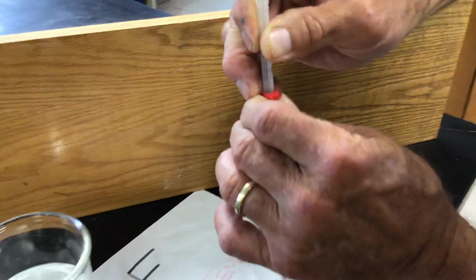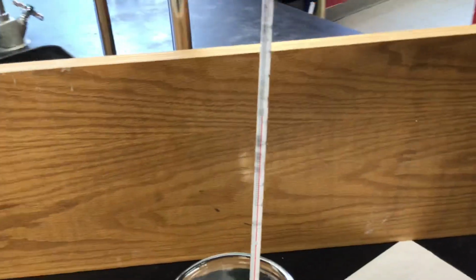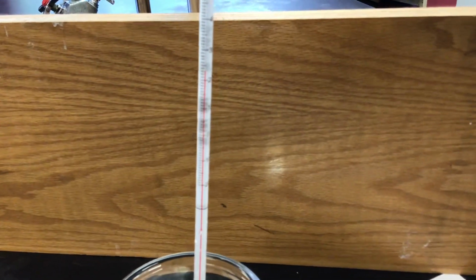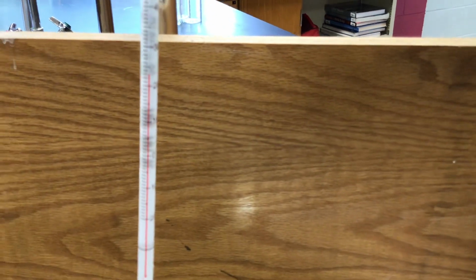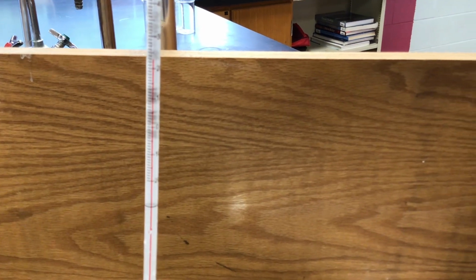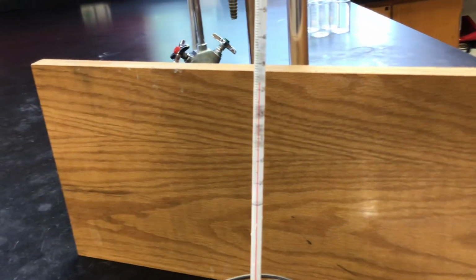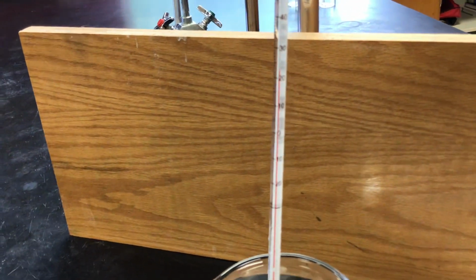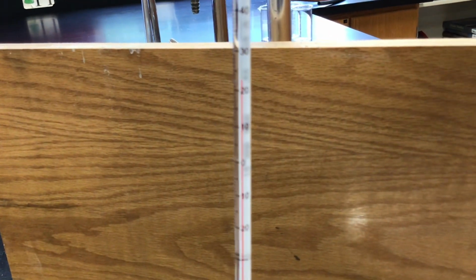No, this is not a mercury thermometer. Unfortunately, the state of Michigan won't let us have mercury thermometers. Go figure, mercury's toxic. This is called a spirit-filled thermometer. There's a red liquid in here, so if the thermometer breaks, we don't have to worry about a mercury spill. Okay, so can you turn it away from you a little bit, so we can see the numbers in here. You can see that the numbers go up by tens.